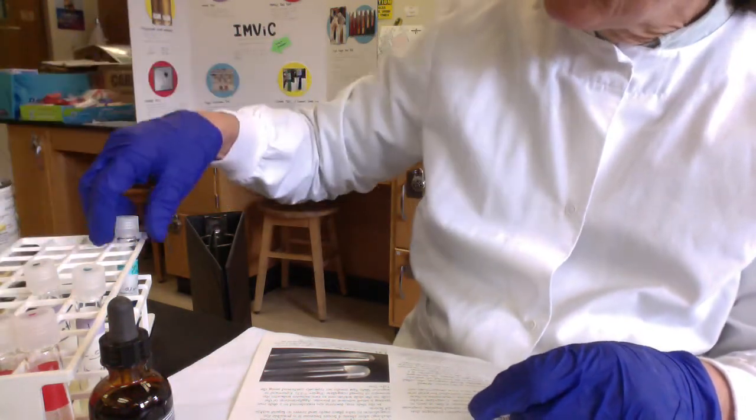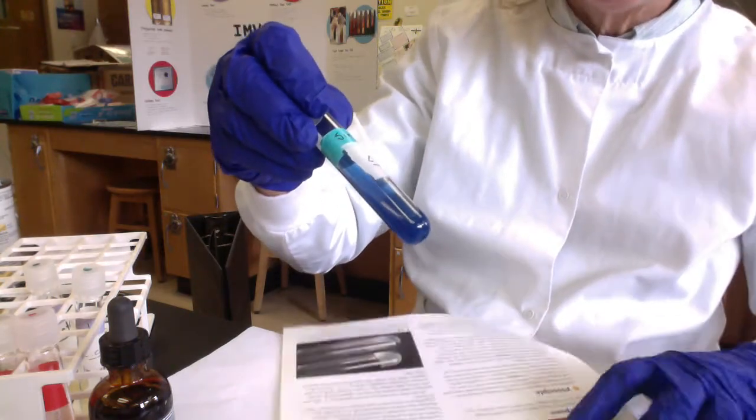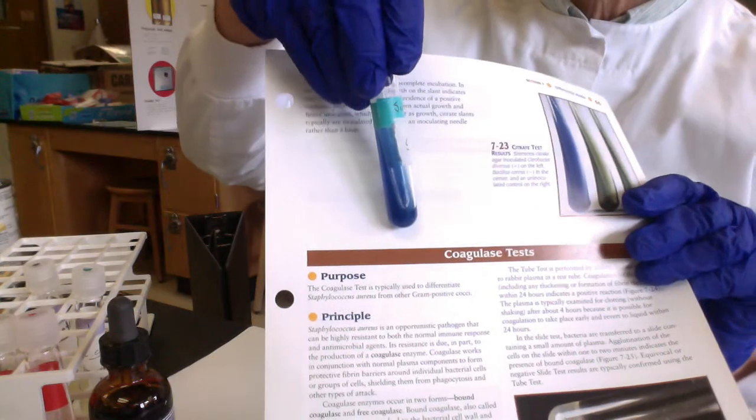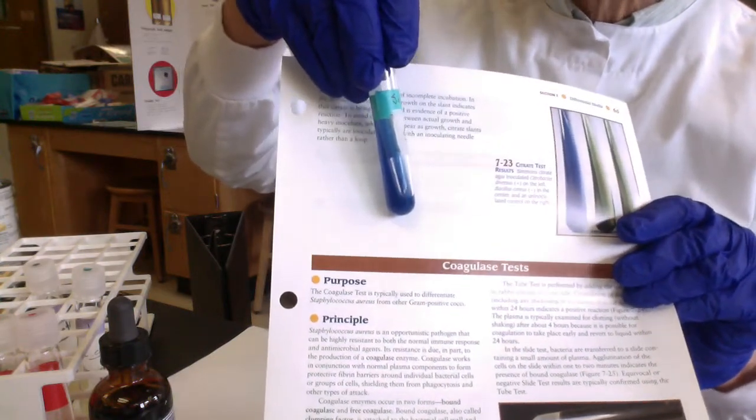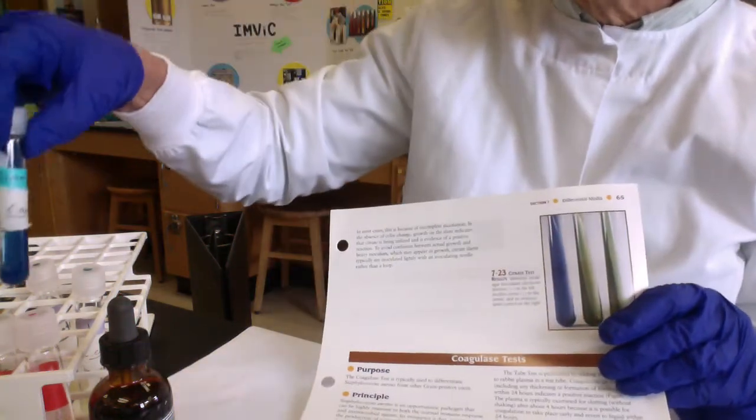But then, you guys, this is my favorite one here. Here's our Enterobacter aerogenes. Isn't that beautiful? So the blue color is telling us that Enterobacter aerogenes can use citrate. This is a positive citrate test, right? Okay, so there we go.